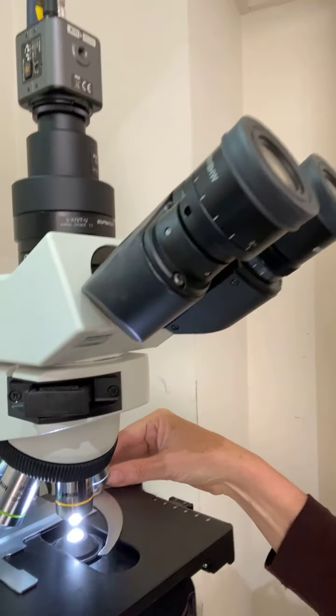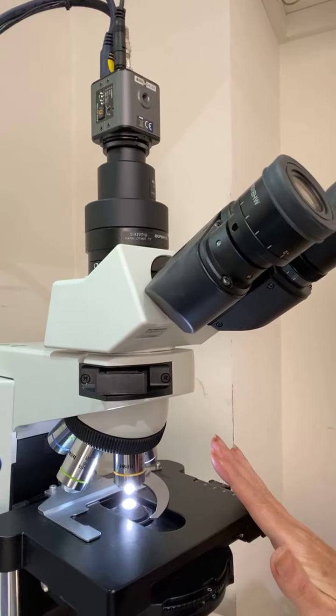Straight away we increase the size of the drop to take a sample for the dried blood. Dried blood lasts, whereas live blood doesn't. You can see the dried blood there on the slide. I'm going to show you one of those in a minute. We bring it up onto the microscope and start to evaluate it on the screen. I can't show you a live blood sample today because they have to be disposed of within about an hour of taking the blood, but I can show you a dried blood one.